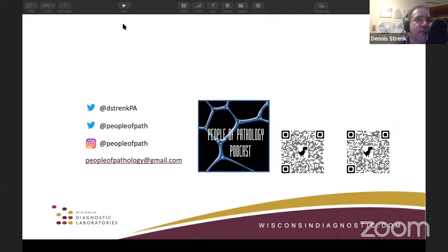They're good if you can quickly go through them and just fill in the details, but it's important not to use them as too much of a crutch. You have to know when to alter the template to fit the specimen that you have. And that's something that I've seen new residents sometimes struggle with, knowing that they can change the template and knowing when to do that.